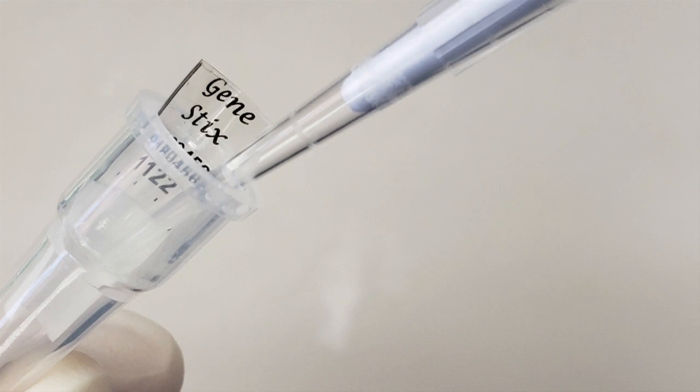Pipette 50 microliters of elution buffer onto the membrane of the GeneStix. Make sure to wet the entire membrane with elution buffer.